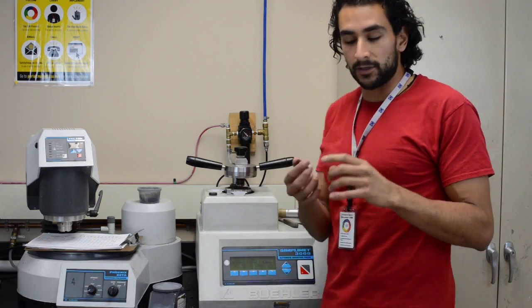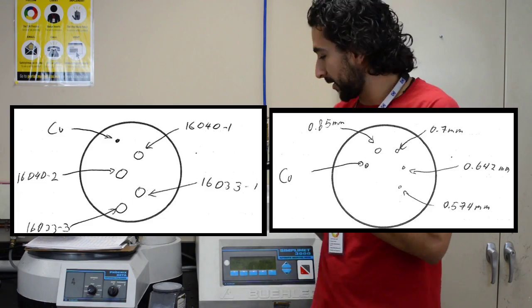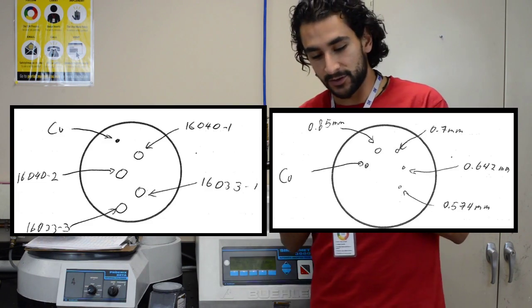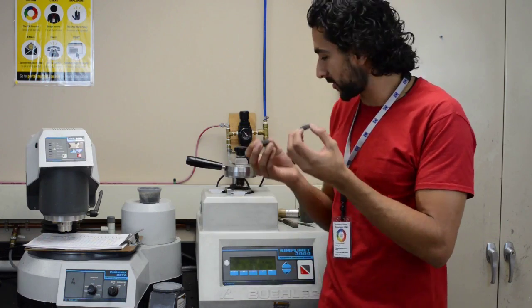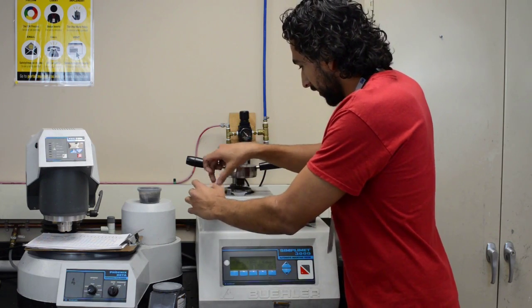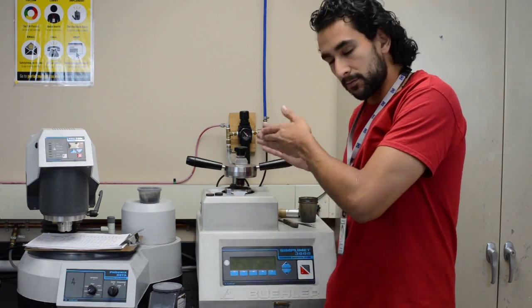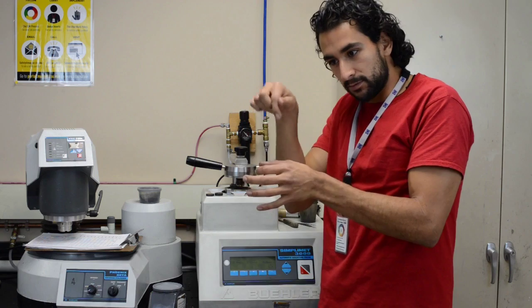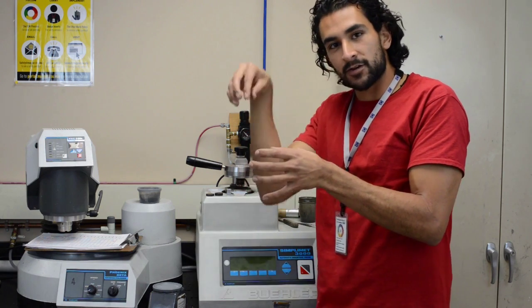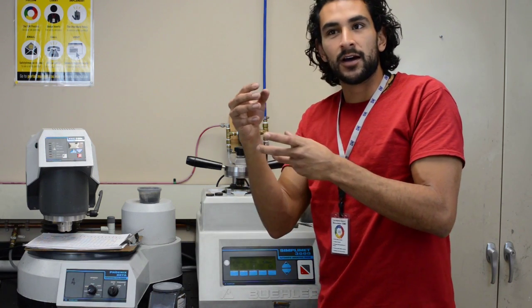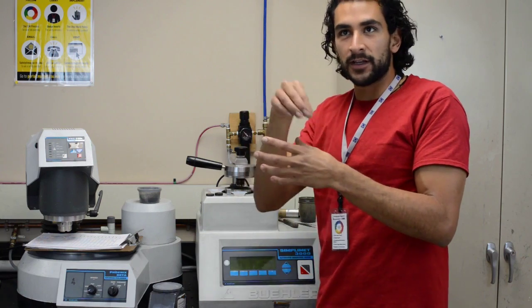So I have both my dummy pucks here with their respective holes according to the diagrams that I've made. And one last thing that you need. So basically what we're going to do is we're going to put the pucks in there, the dummy pucks, put the samples in and then fill in the rest with more conductament.